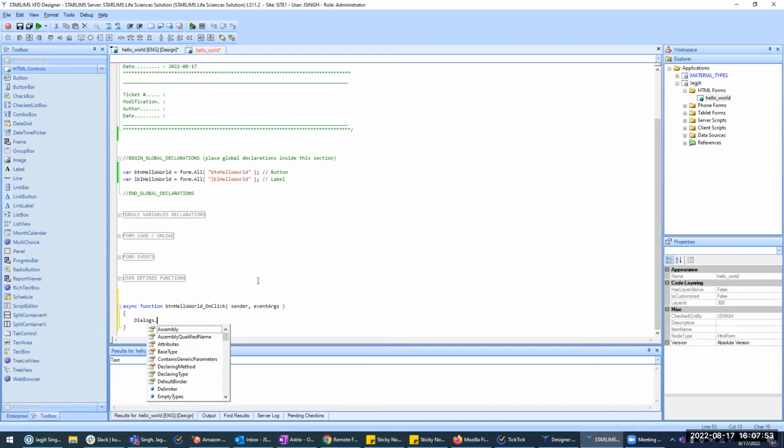And you have all these methods and properties. So look for scroll, right? Let's see what's in here. All right, you have all these to play with, but let's just keep going. Message box, you see it? Message box, double click. Now open a parenthesis.